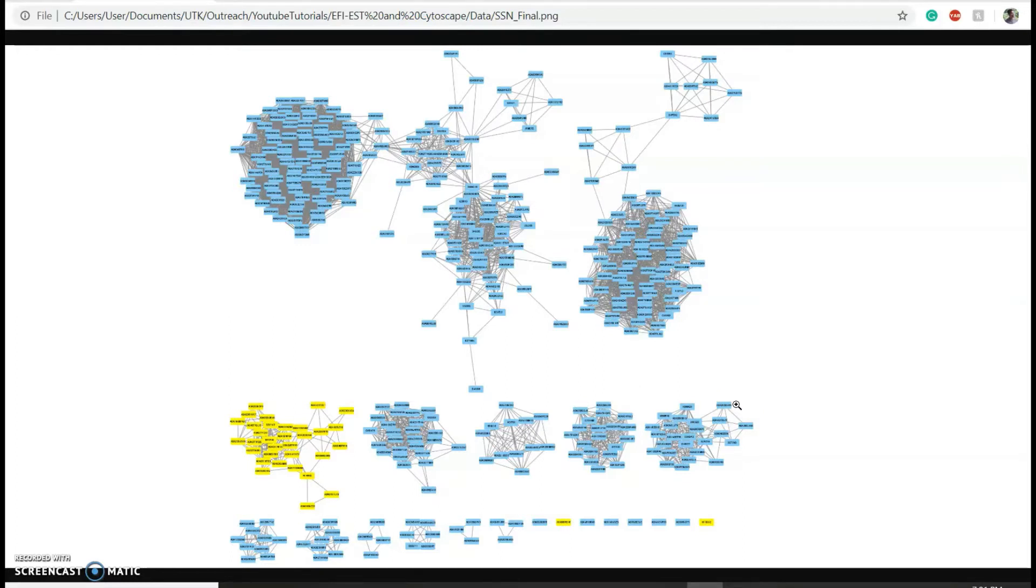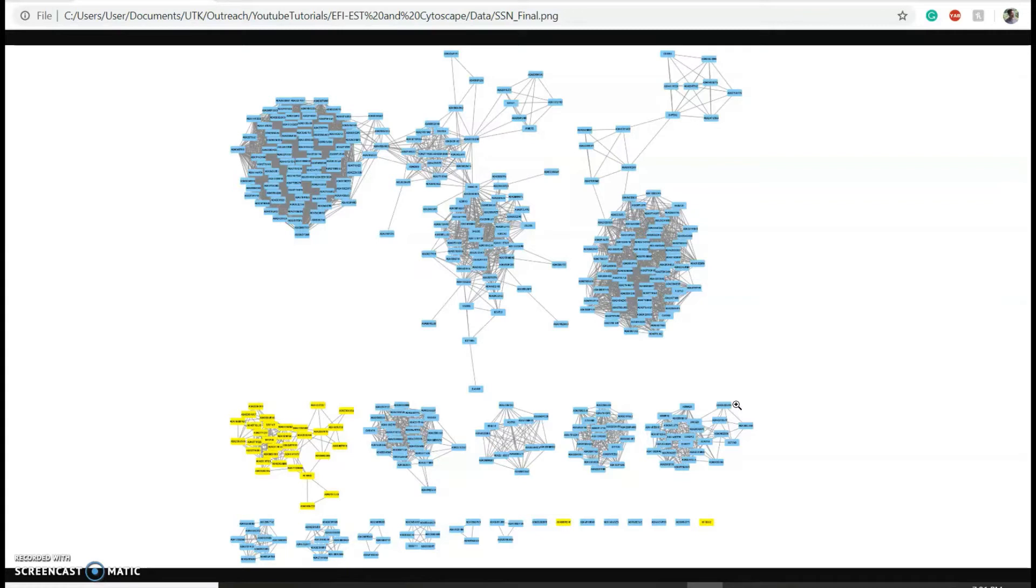Today I will be using the Enzyme Function Initiative tools and Cytoscape. Specifically, I will generate a sequence similarity network for a protein in Xenorhabdus nematophila called nlpc and its closest 1000 homologs from other bacterial species.